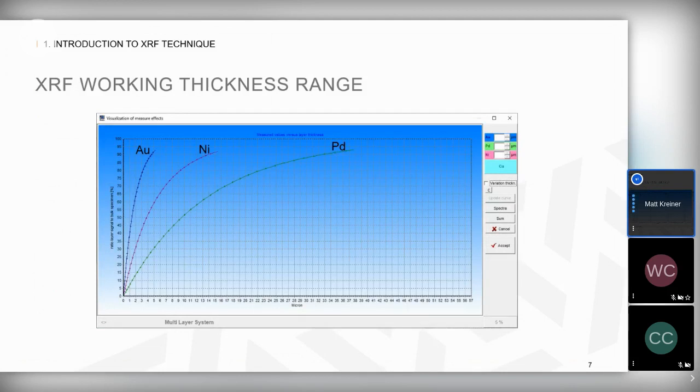This is a visual representation of the XRF sensitivity for ENEPIG, electroless nickel electroless palladium immersion gold. Gold is the blue line on the left, palladium is the green line on the right, and nickel is the purple line in the middle. You can clearly see the effect of an element's density and its x-ray strength in this plot. Palladium is efficiently excited and has sensitivity to about 40 microns. For gold, where we need to use the secondary L lines because the x-ray tube doesn't have enough energy to fluoresce the stronger K lines, we see sensitivity to approximately 5 microns, almost an order of magnitude less than palladium.